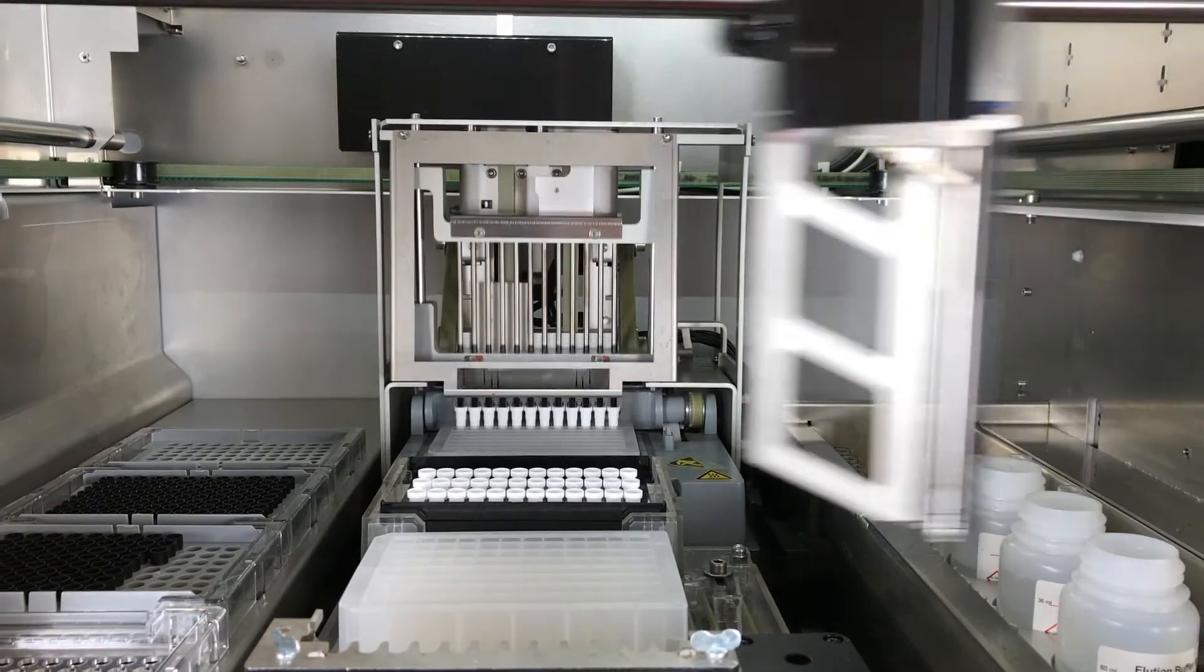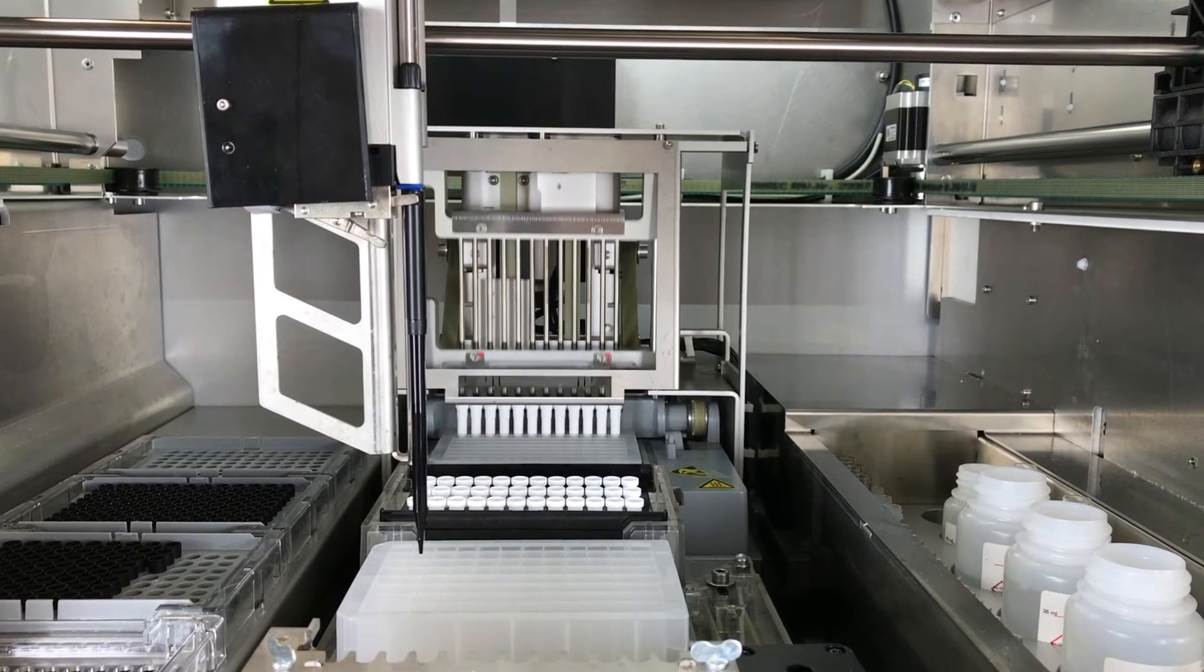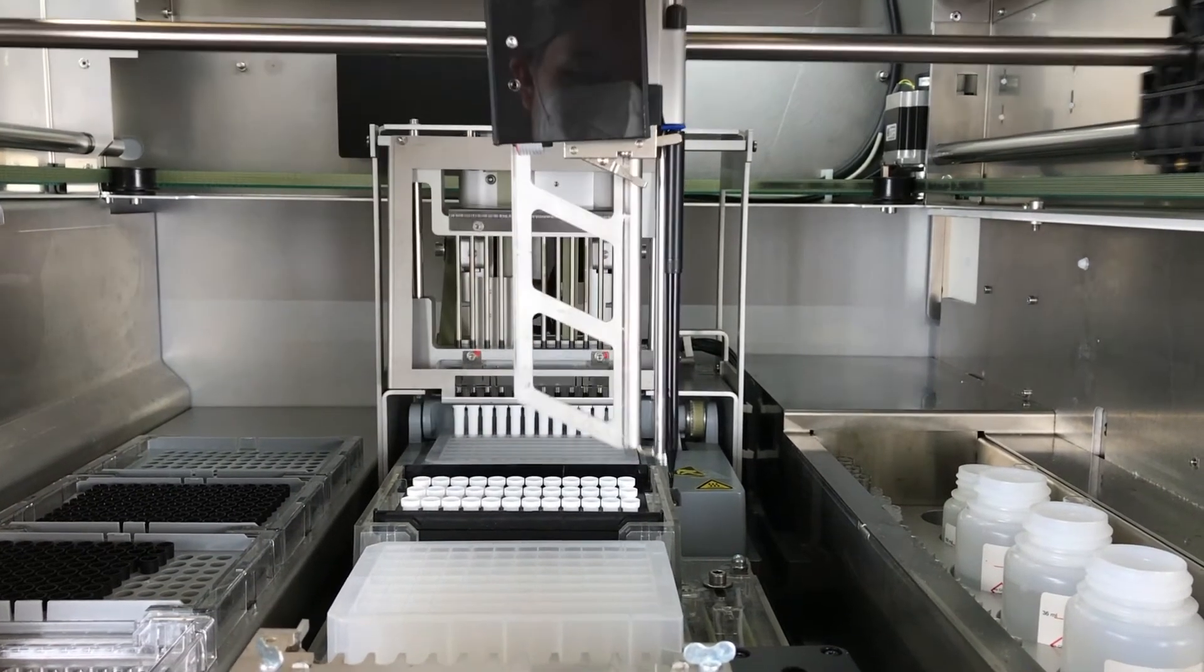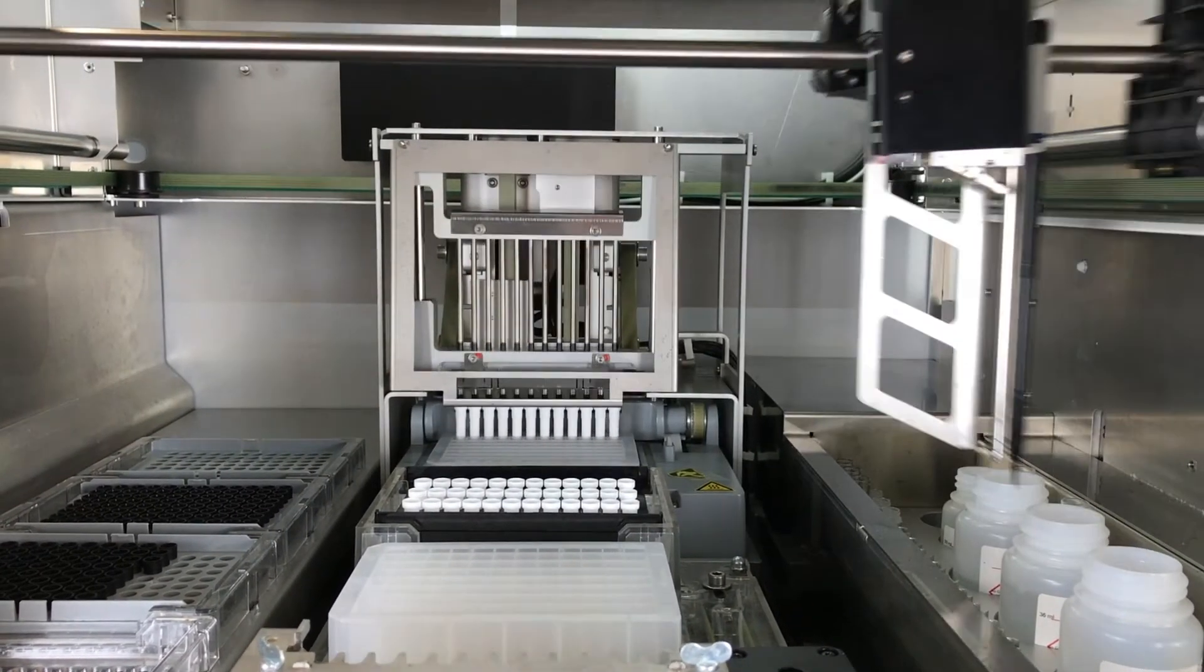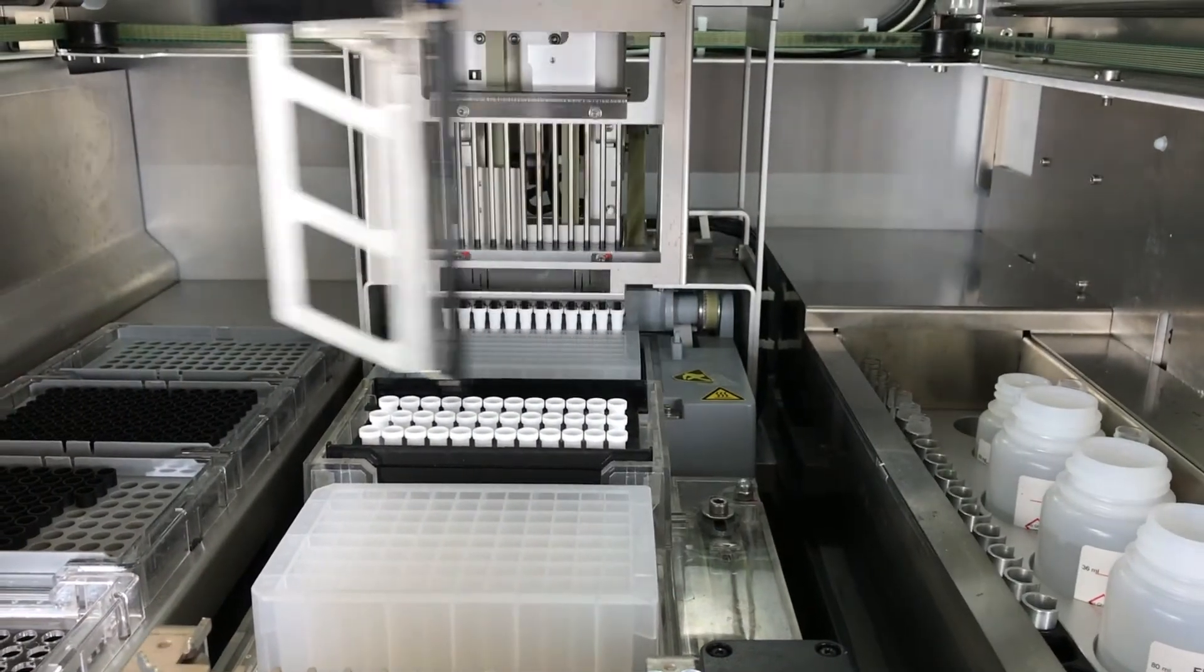Liquids are transferred by a single channel pipette head. Conductive filter tips for liquid level detection are used. The anti-contamination motion of the pipette head prevents carryover.